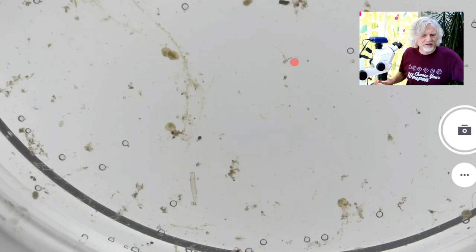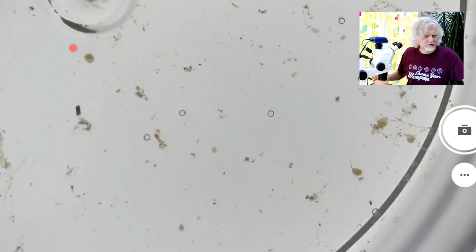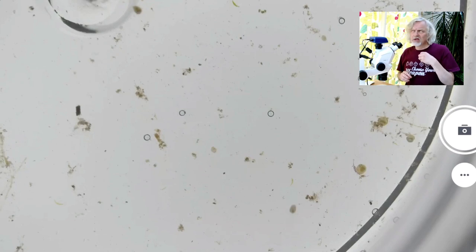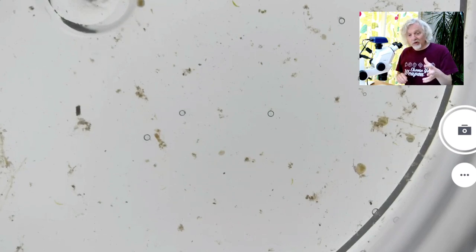But can you see these little things, these little tiny little seeds, almost these little grains of rice whizzing around? There's one that's really doing the hokey cokey. Let's keep going around. So these are tiny little crustacea. That means they're related to crabs and shrimps and lobsters.